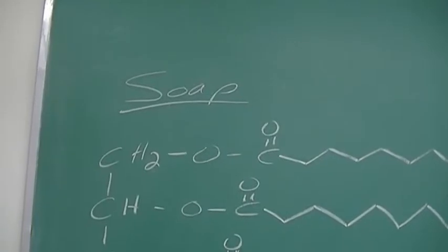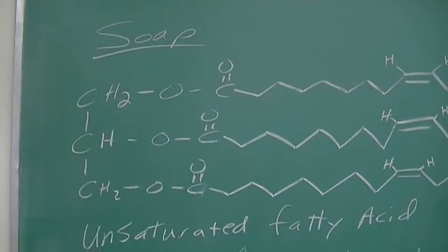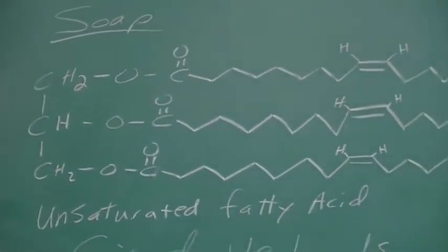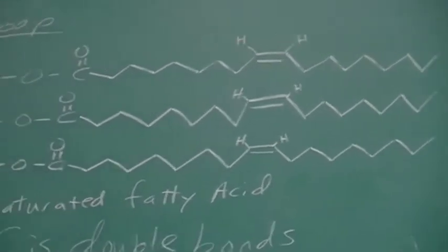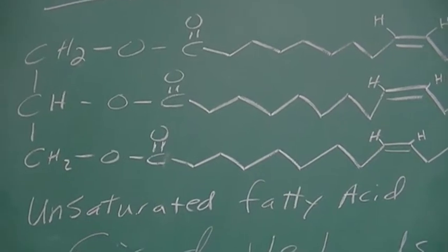Alright, today's lab is making soap. The soap that we're going to make in the lab today, we're going to use vegetable oil. And here is a structure of a vegetable oil. Alright, and so it is a triglyceride.